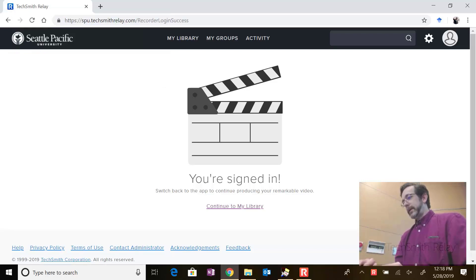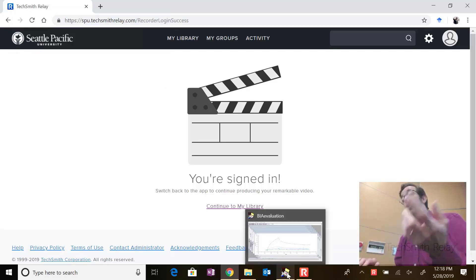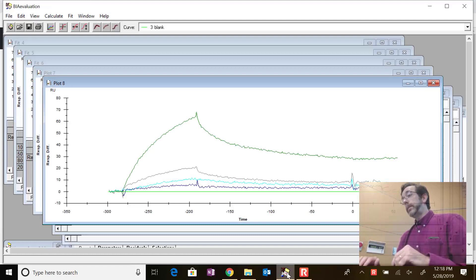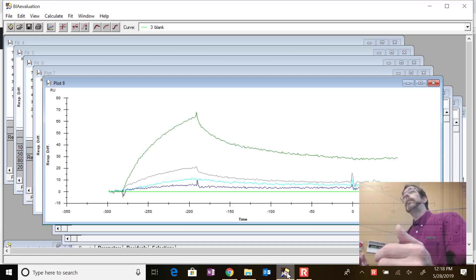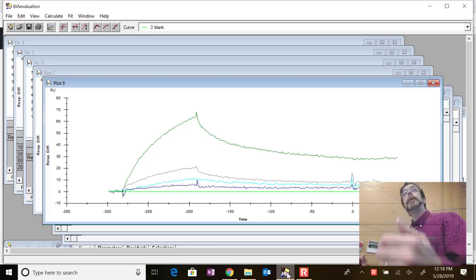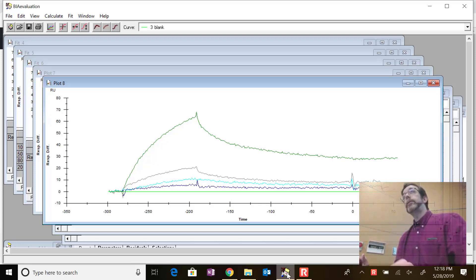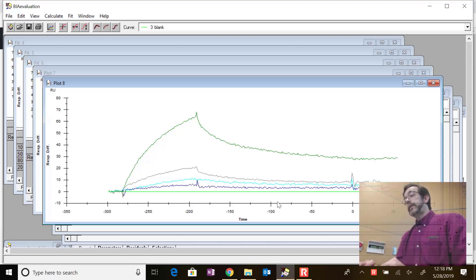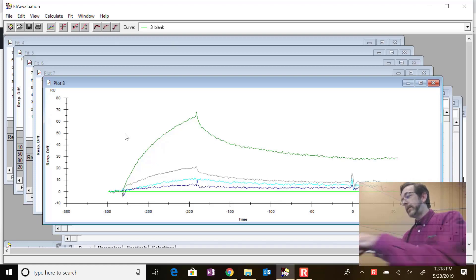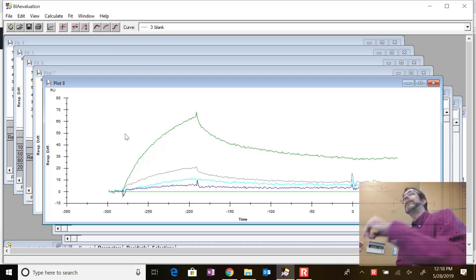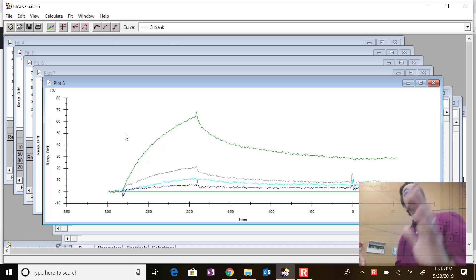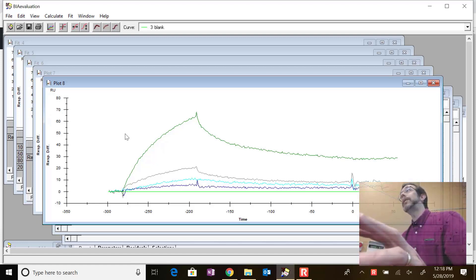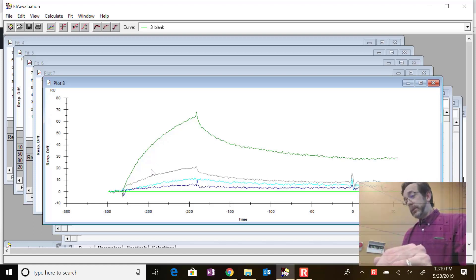Now that we've learned the material from chapters 6 and 7, we're going to go back and apply those integrated rate equations to the data you've already collected. Here's an example of Rhian's data. I've got my USB mouse and now we're going to be able to use that on one of the two computers.